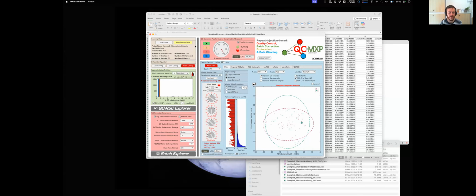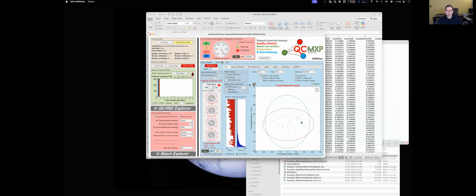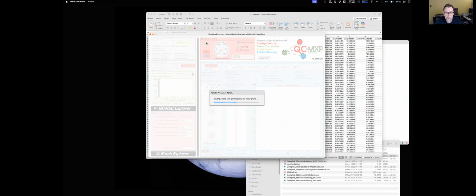I think you briefly mentioned during your talk, after the question was put in, but the question is, if someone didn't run a QC during data acquisition, what can be done without a QC sample? Well, like I said, I have implemented the algorithm so that you can correct just using the samples. Let me just run this whilst I'm answering a question. So we're doing within batch correction on the sample, between batch correction on the sample. And I'm hoping this is super quick and actually works.